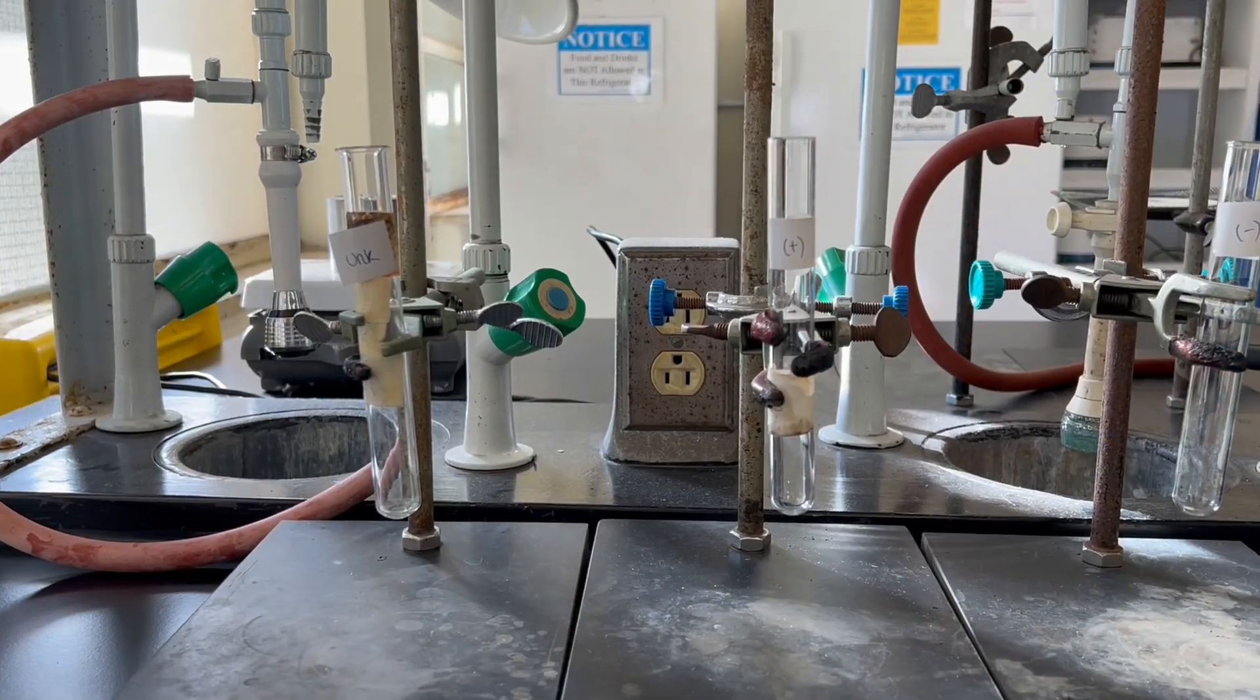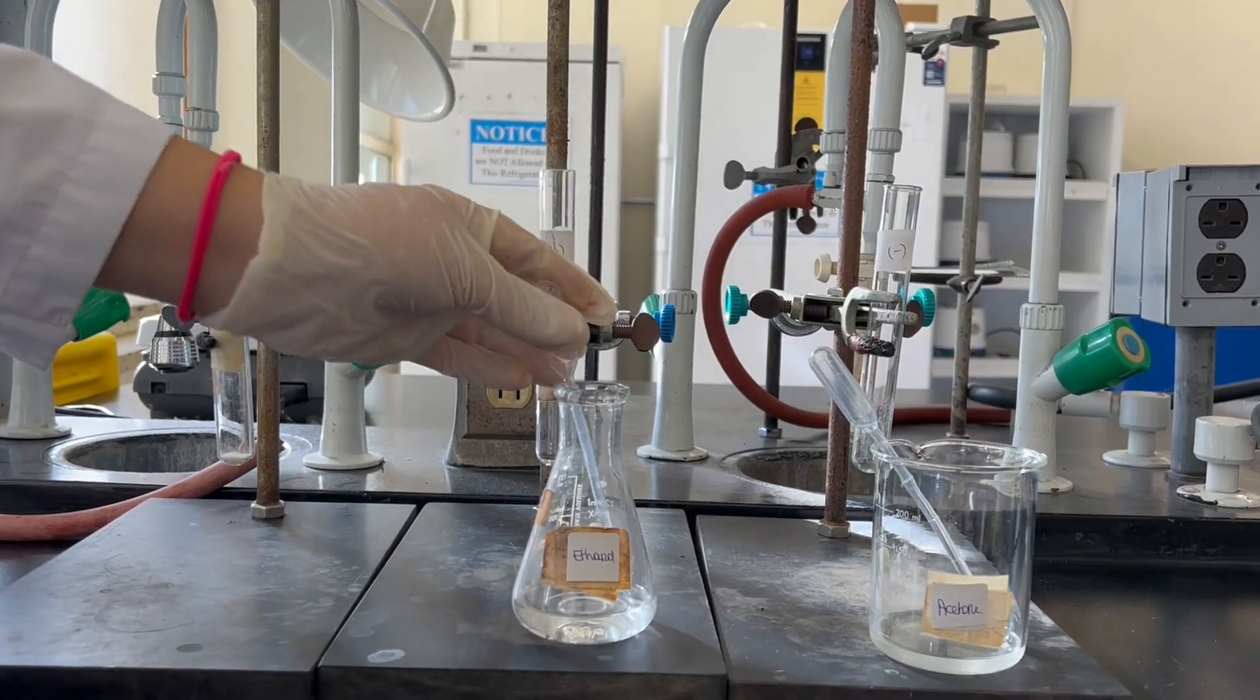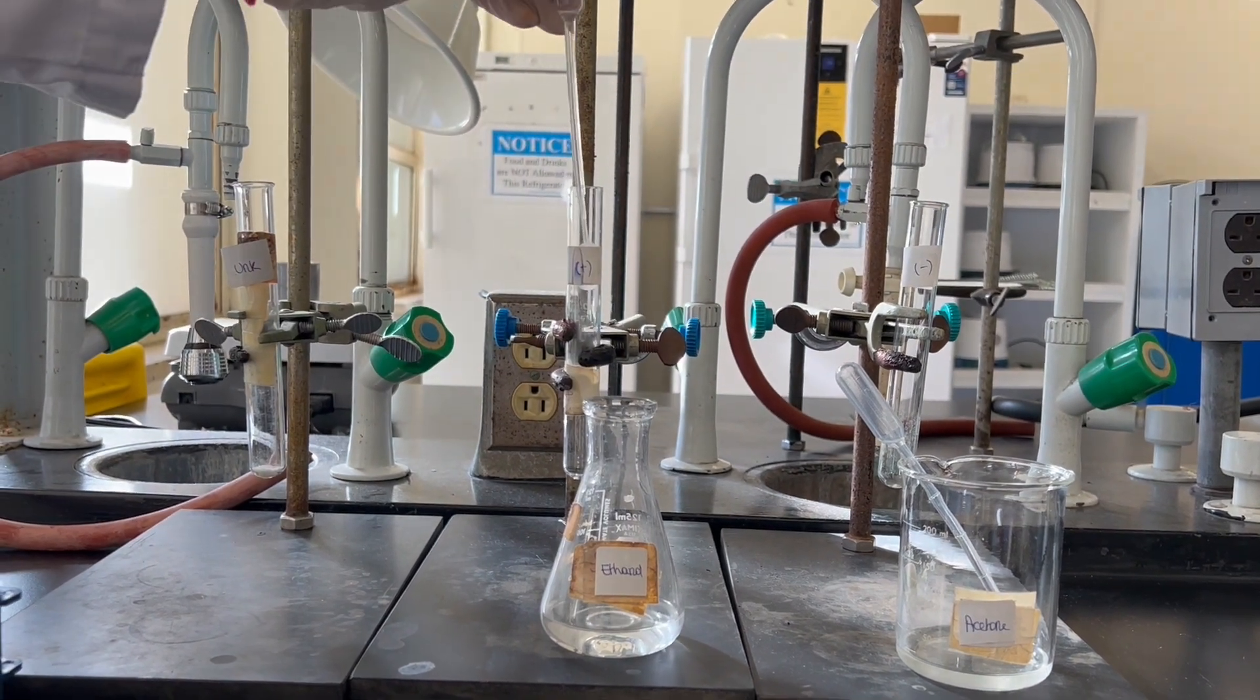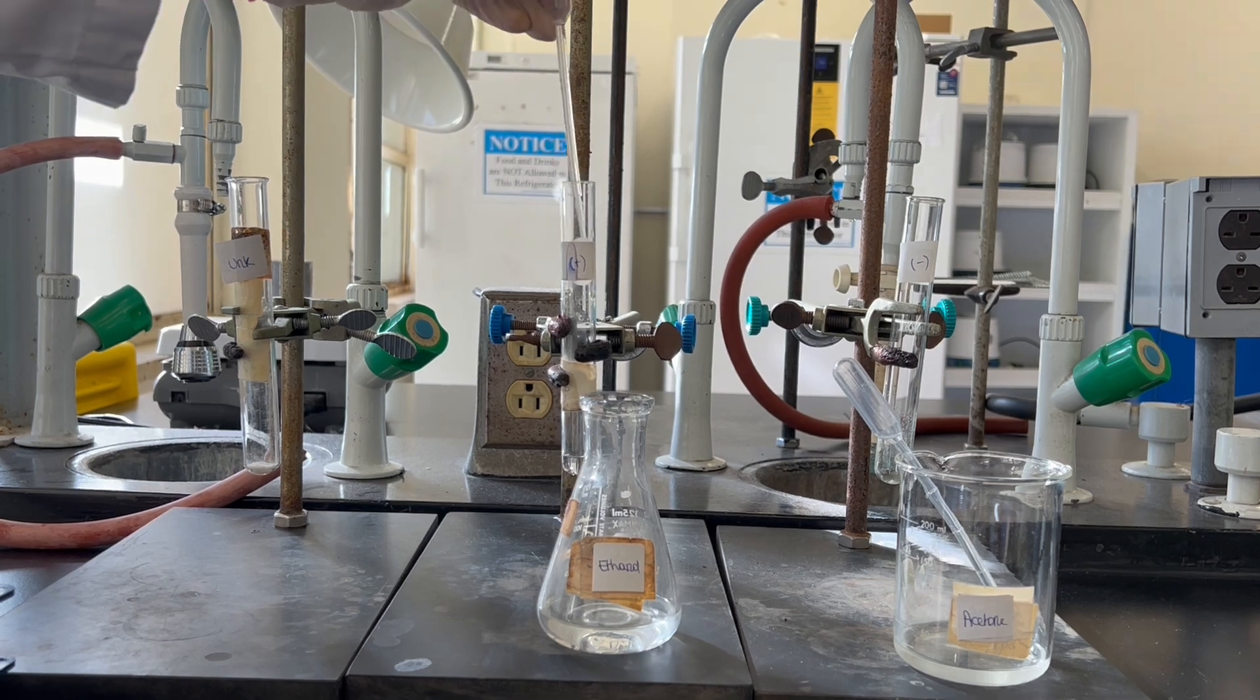In the first test tube, we will add a few milligrams of our solid unknown. We will use ethanol as a positive control since it is a primary alcohol, and pipette a few milliliters of ethanol into the positive control test tube.